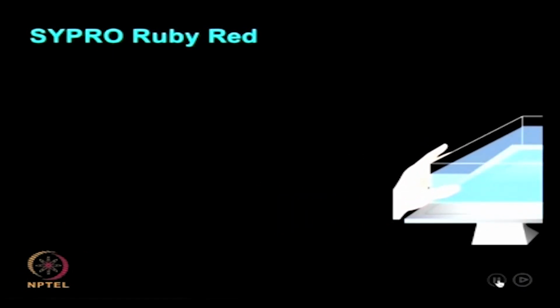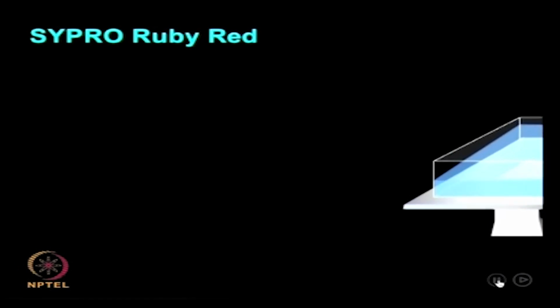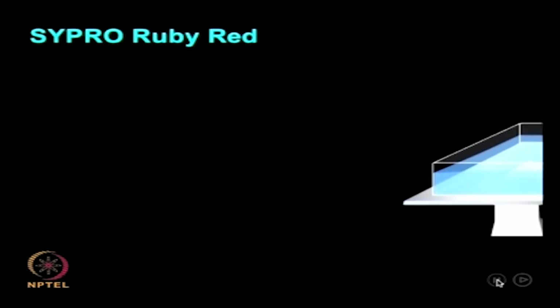Again, you need to keep it on rocker so that uniform de-staining can be performed.